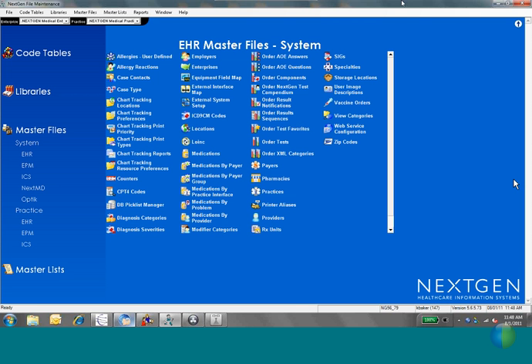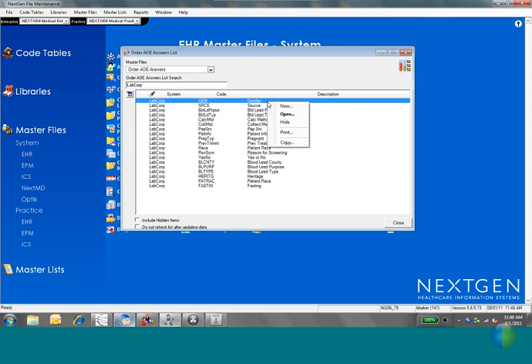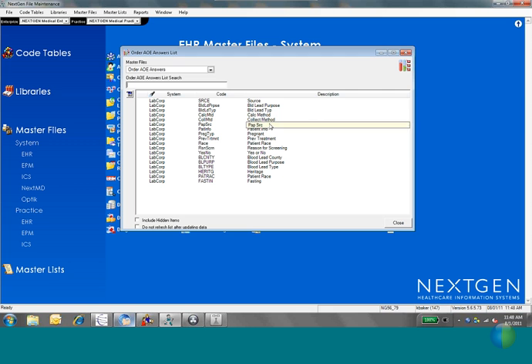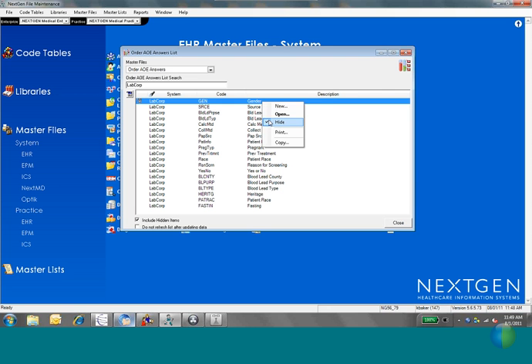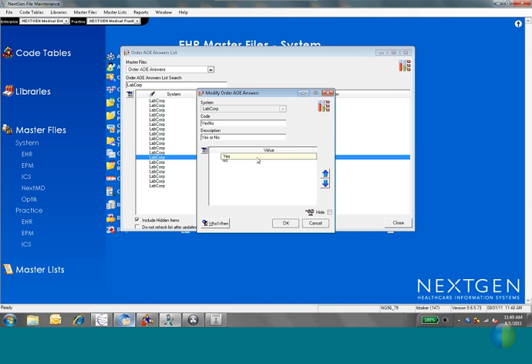All right, so let's move forward. Oops, I see a question real quick. Let me see. Somebody had a question that you couldn't delete or hide in the AOE answers. You should be able to hide okay. You might have to be more specific with your question. Was there something specific you were trying to hide? You can't delete in file maintenance, but you can hide. So I guess I'll have to see what you're looking for.